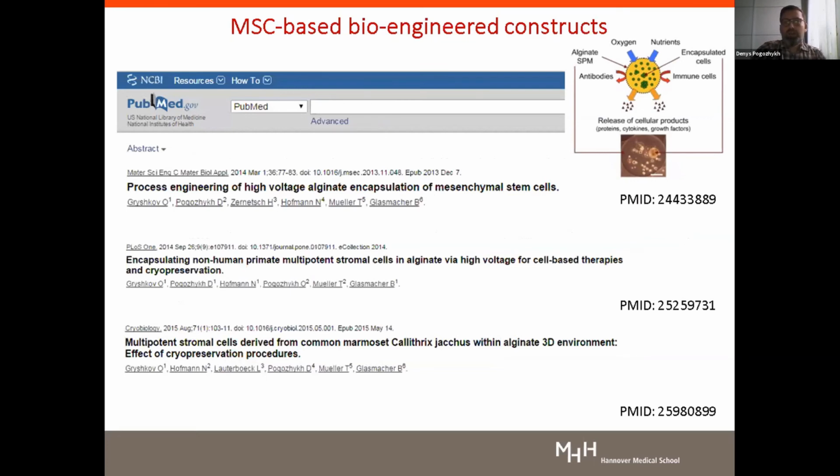The previous speaker, Professor Birgit Glasmacher, her group has excellent experience and great expertise in this. We also worked together on a lot of these projects, and in particular we adopted this technology with placental MSCs with some really nice results, and we also looked at the possibility to cryopreserve these constructs.